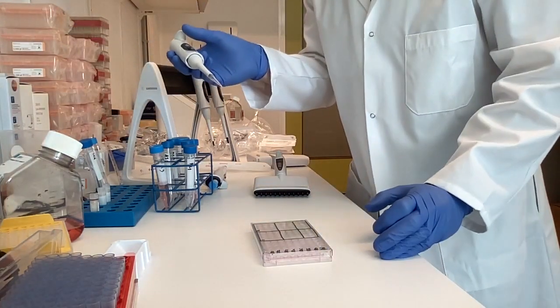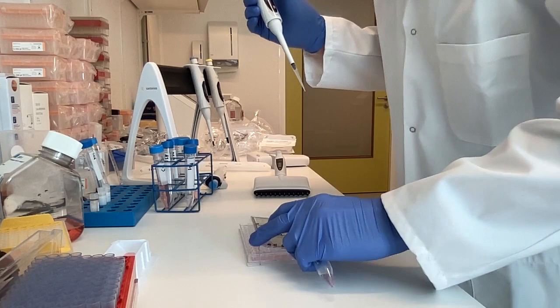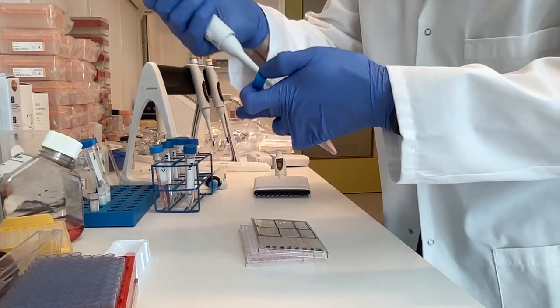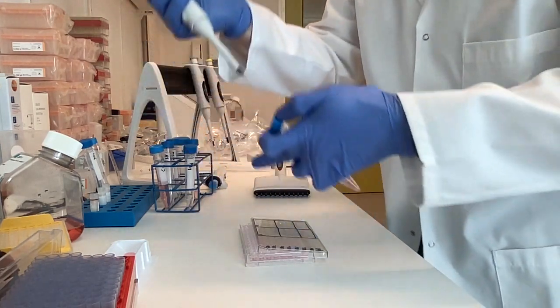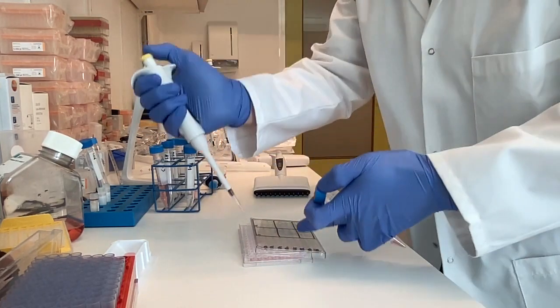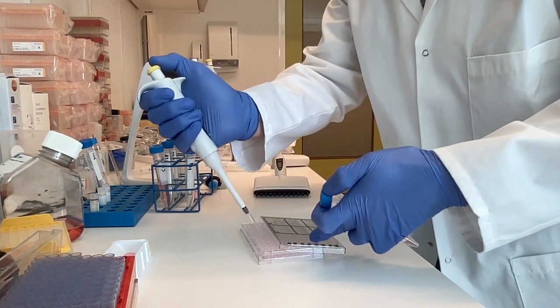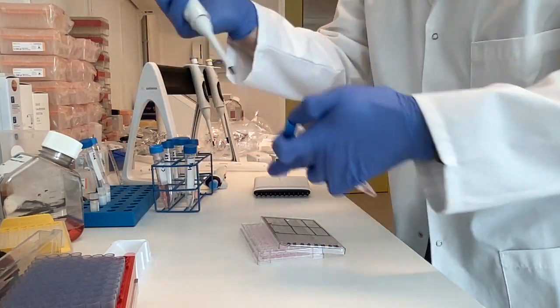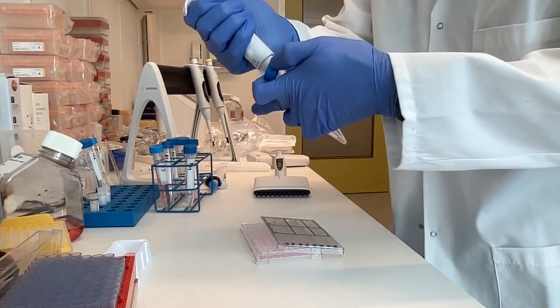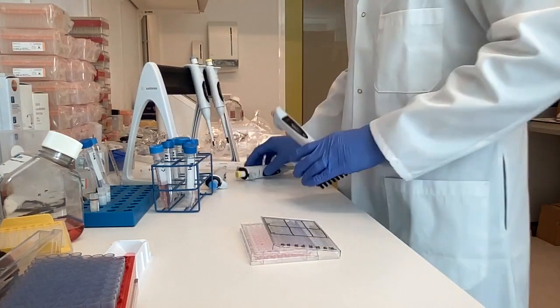Again, you can do it with a multi-channel or a single. You're going to take your prepared product number 1 and add 100 microliters to row A. And because we're going to do the serial dilution, you're also going to add it in B, to serial dilute.